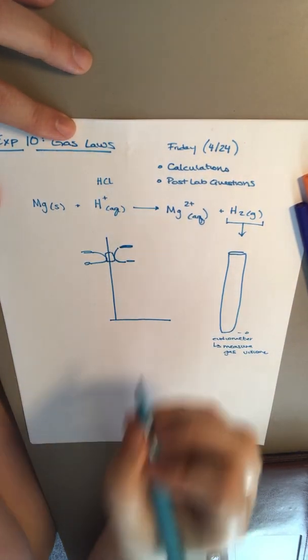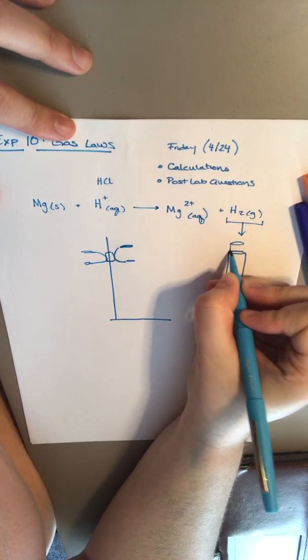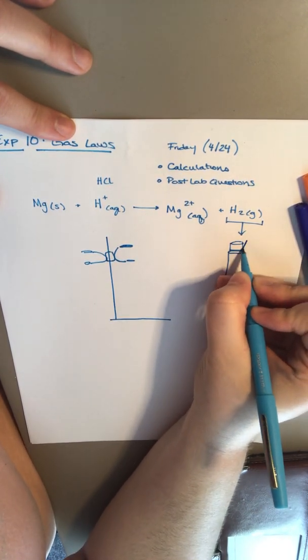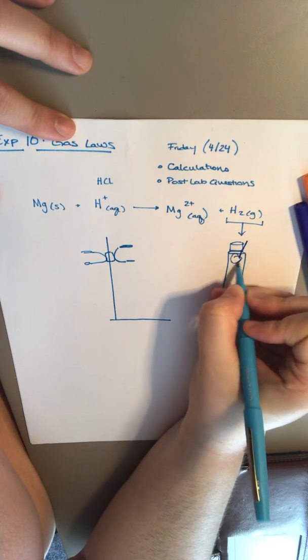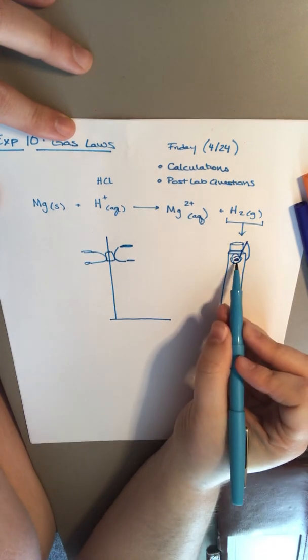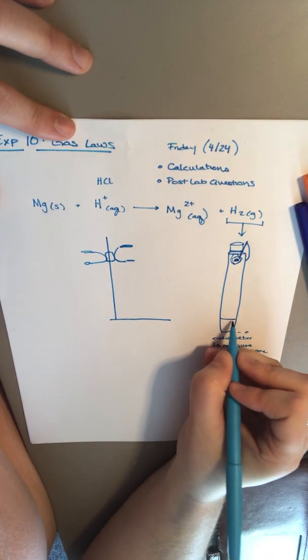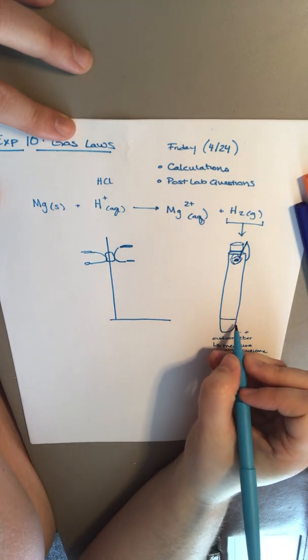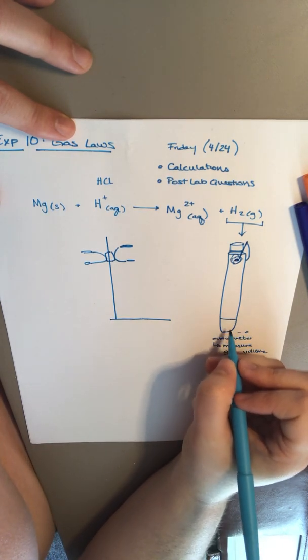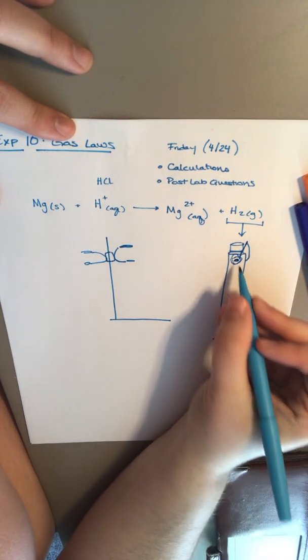So at the beginning of this experiment we have a stopper, and what we're going to end up doing is creating a cage around this little piece of magnesium metal. This magnesium metal, when it comes in contact with this HCl, which is more dense than water, which is why we're putting it in first, is going to slowly dissolve away that metal when we flip this.